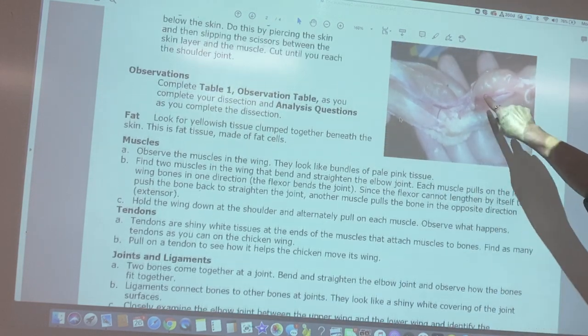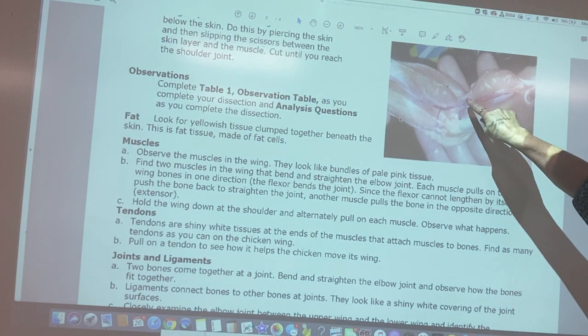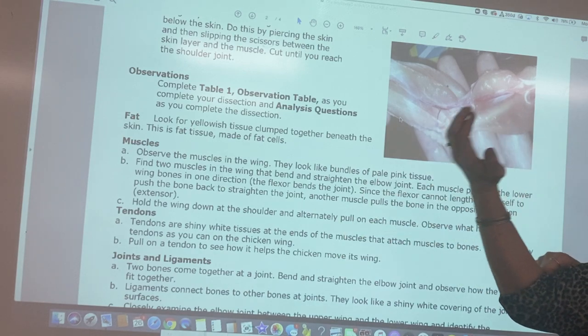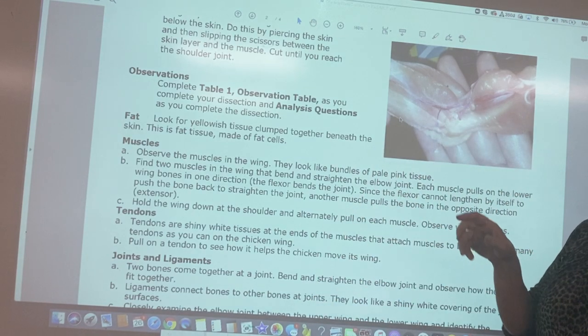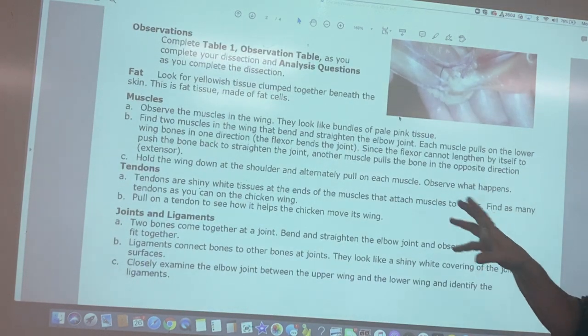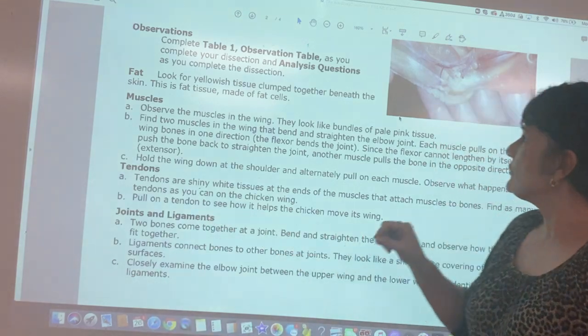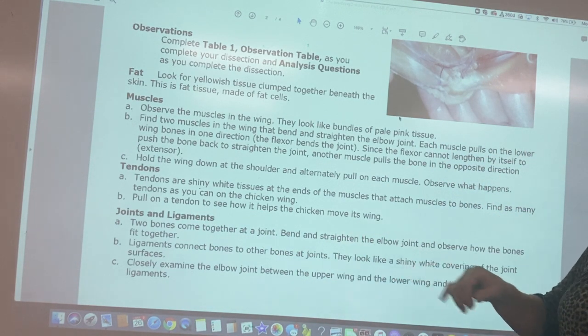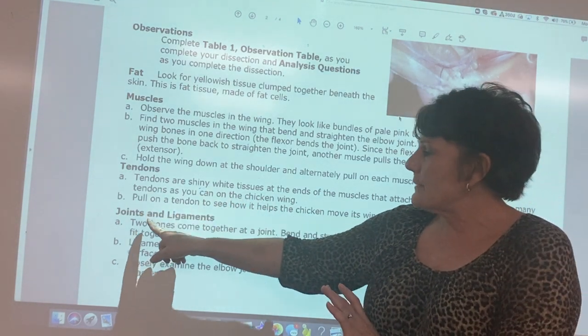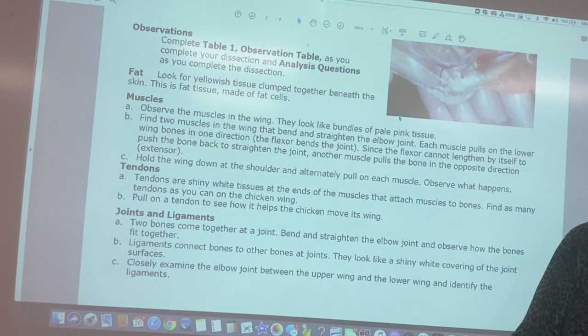The muscles will appear as pinkish tissue. At the ends of muscles there will be white silvery bands called tendons, which attach muscle to bone and cause movement — we'll demonstrate that during the dissection. At the joints, bones are held together by clear bands called ligaments. Anywhere two or more bones come together is called a joint, and movement happens at those joints.